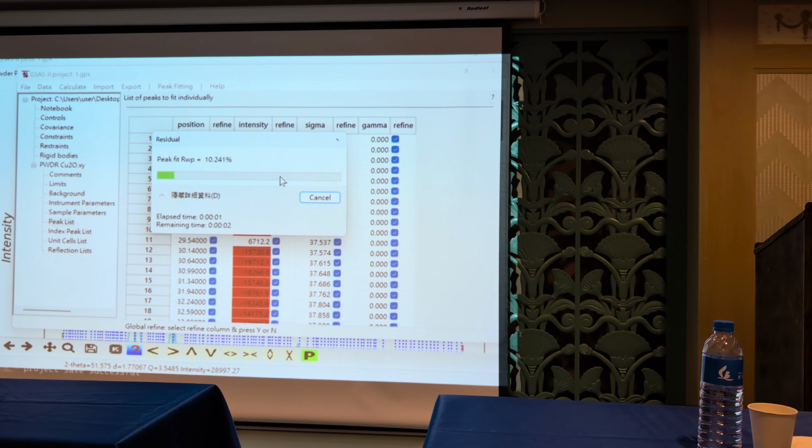And once you got a space group, you need to insert the atom individually. So for example, if you give you the space group like Fm-3m, then you need to fill in the atoms. For example, you need to put the copper at the position in this phase, say 0, 0, 0, or half, half, half. Then you need to make it. You need to try if this model fits your diffraction pattern. So that would be done manually.